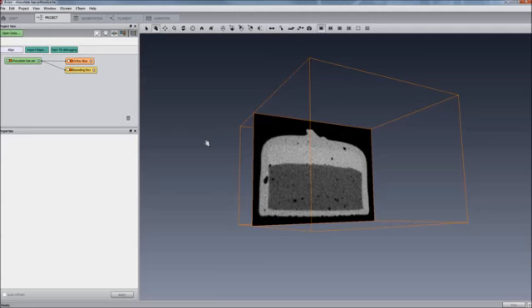Left mouse button to rotate the object, left and middle mouse buttons together to zoom in and out, the middle button alone for lateral moves, and the space bar to make the entire scene visible in the window. Another shortcut to learn is the Escape key, which switches from viewing mode to interaction mode and back. When in interact mode, pressing the Alt key can also be useful for temporarily switching to navigation mode.